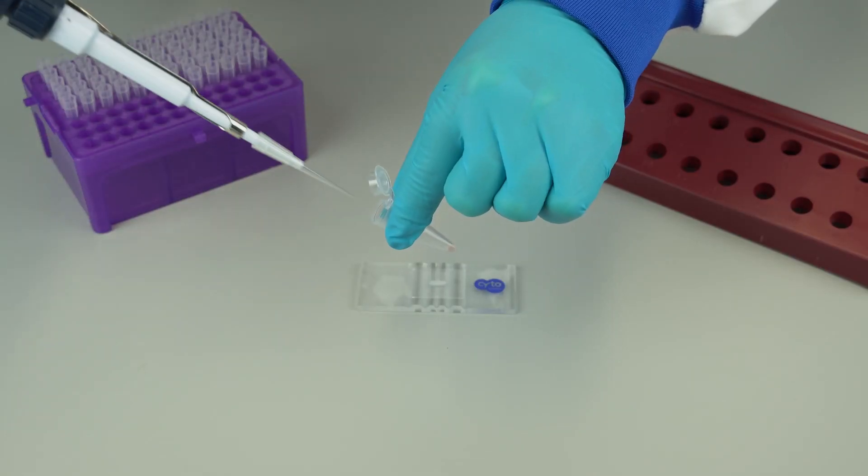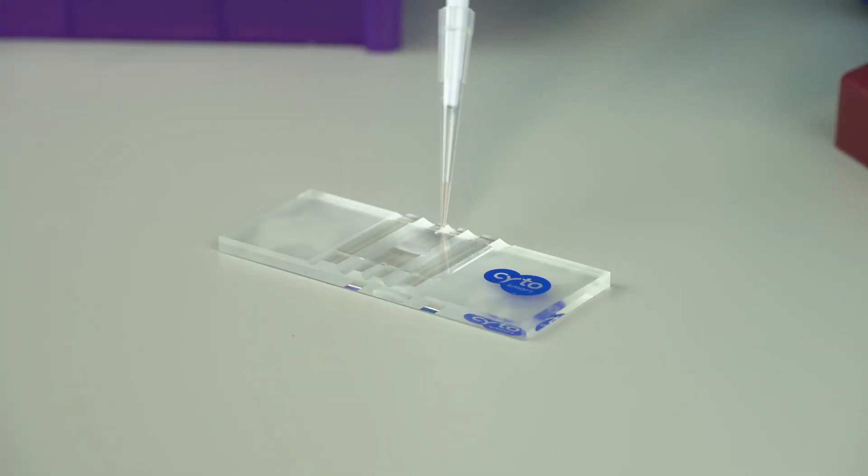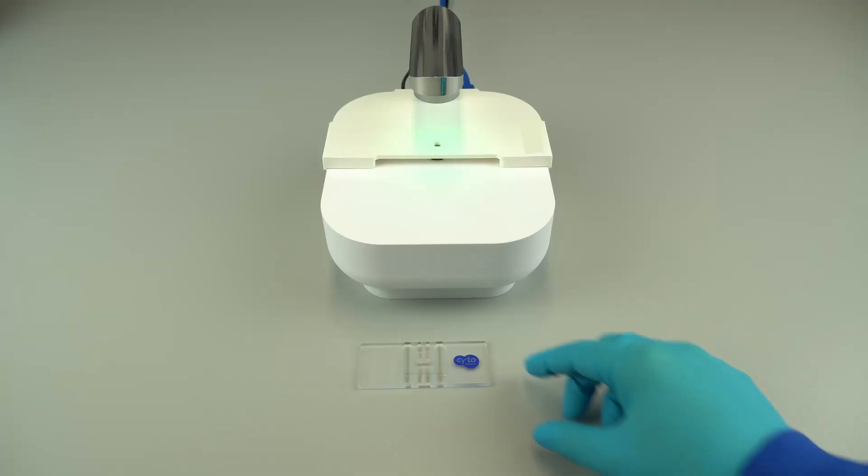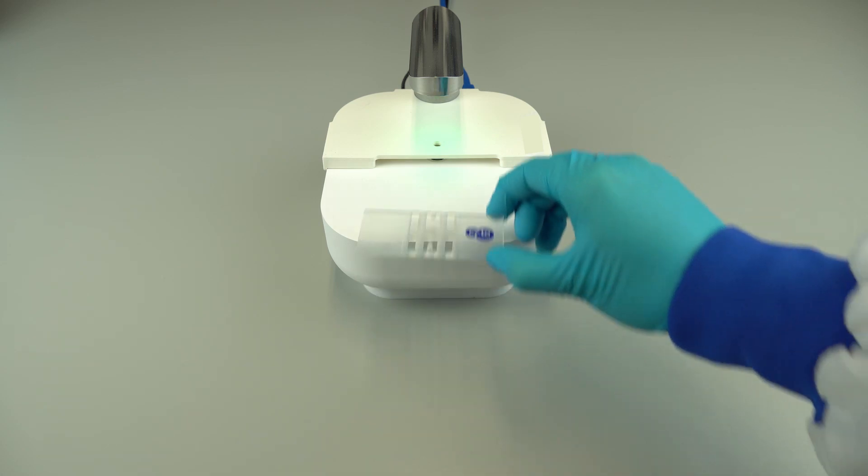Take 10 microliters of the sample and load the chamber of the counting slide. Place the counting slide on the ExactFL.